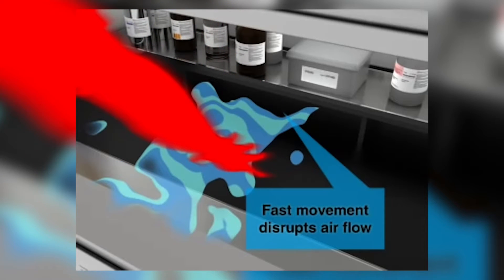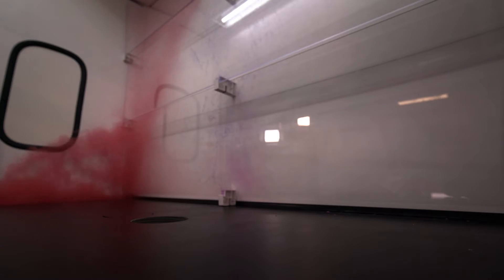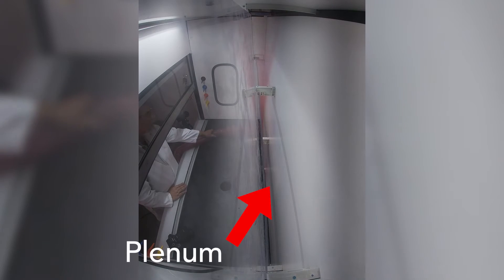Just like water running downhill, air flows from high pressure areas to low pressure areas. In a fume hood, the low pressure area is the plenum — the plenum is the space between the baffles in the back wall.